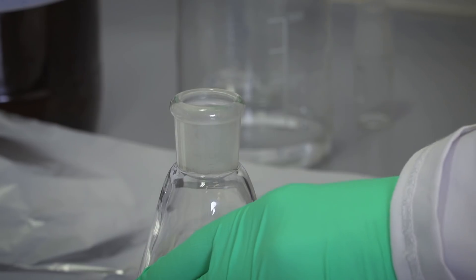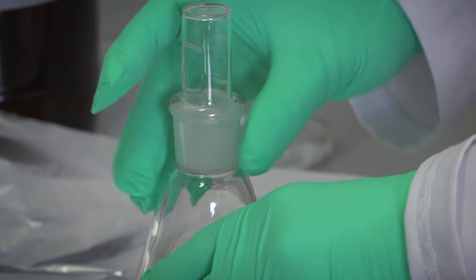Inovia's research and development specialists have investigated this issue extensively to find a solution. To test for mineral oil barrier, we set up a sandwich structure to mimic a pack that you'd find on any supermarket shelf.